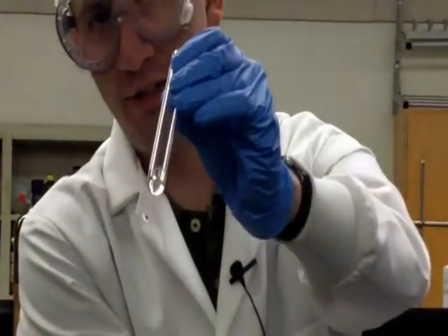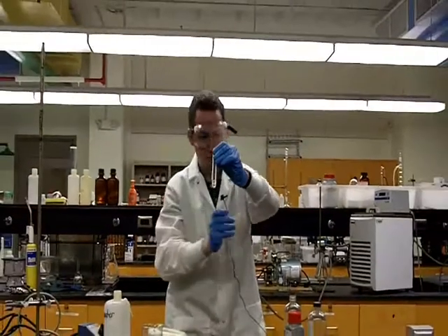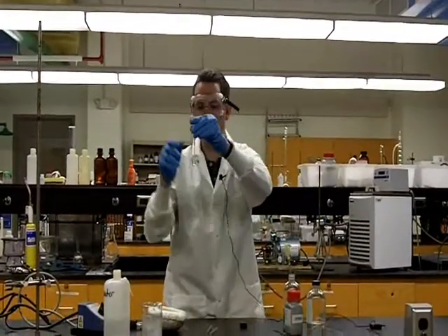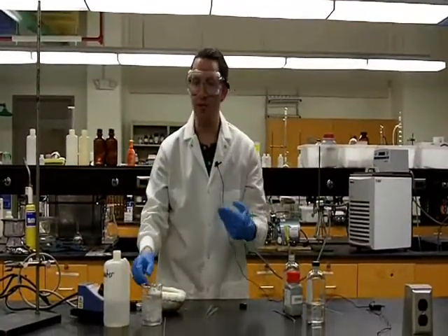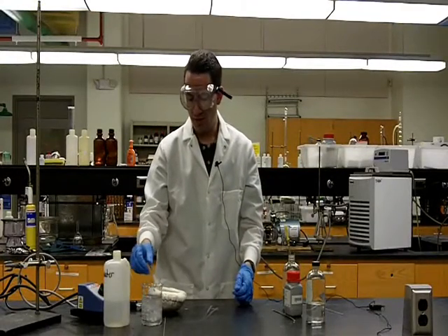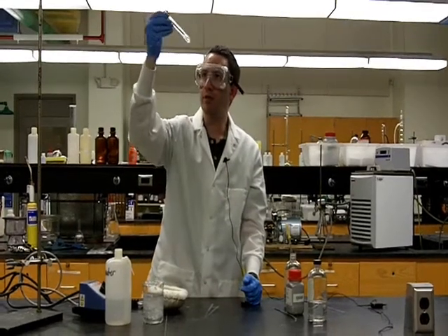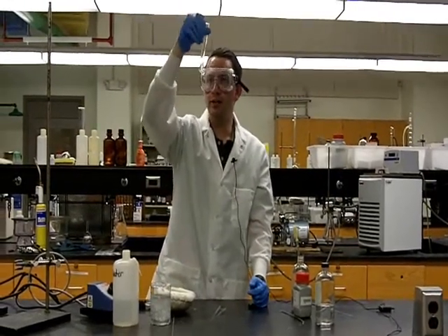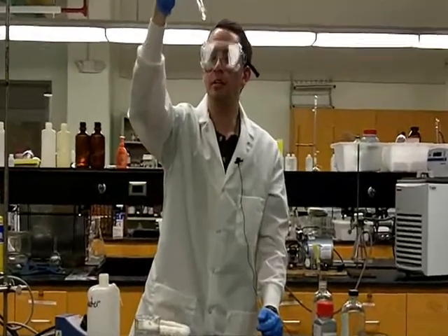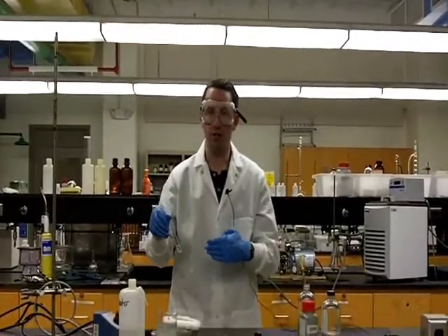Now we have to be careful when we're boiling off solvent, because as we boil off solvent we also reduce the volume of solvent. So if we boil it for too long, we'll decrease the amount of solvent, and then we may need to add more to make up for what has already boiled off. And so that's what's happened here, is I let it boil for too long and we ended up decreasing our amount of methanol. But now that I have a sufficient amount of methanol and I brought it to a boil, we can see that it has completely dissolved.